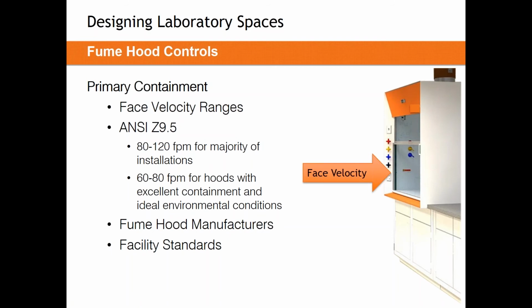It gives a range, I believe, between 50 feet per minute all the way up to 150 feet per minute, and breaks down for you what's good, bad, what costs you money, and what doesn't work. And really, it doesn't tell you exactly what to do for every hood. It's not there to do that for you. It tells you in each range what the pros and cons are.